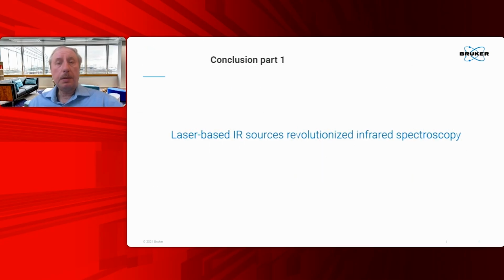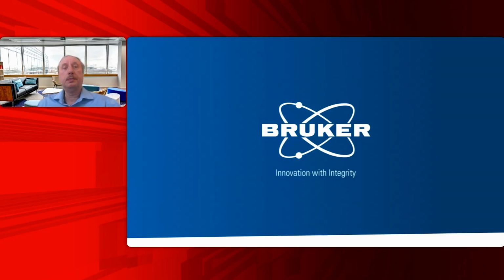In conclusion, I think I convinced you that laser-based infrared sources revolutionize infrared spectroscopy. In my opinion, QCL-based systems will substitute FTIR systems in the near future, at least for many different applications. With this, I would like to switch to our next presenter, who will tell you about what kind of QCL and broadband lasers are available from Thorlabs. Thank you.